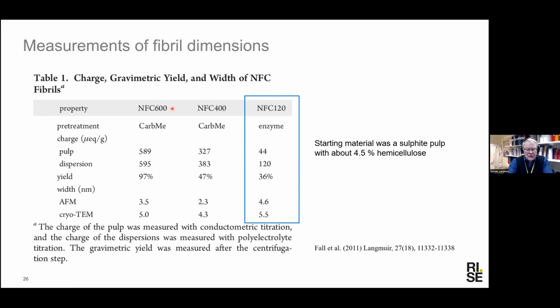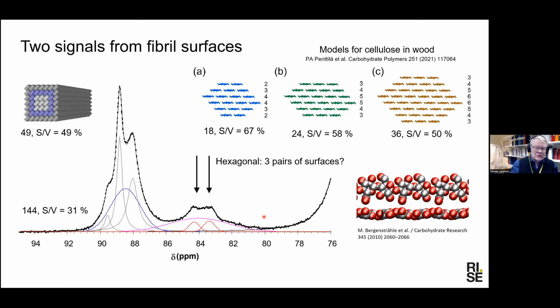determinations made with AFM, with microscopy, you see that we get, for a rather mildly charged enzymatically degraded cellulose, 4.6, 5.5 nanometers. So it's just not a single time that this lack of 18 chain fibril shows up after isolation. It's more of its consequences.